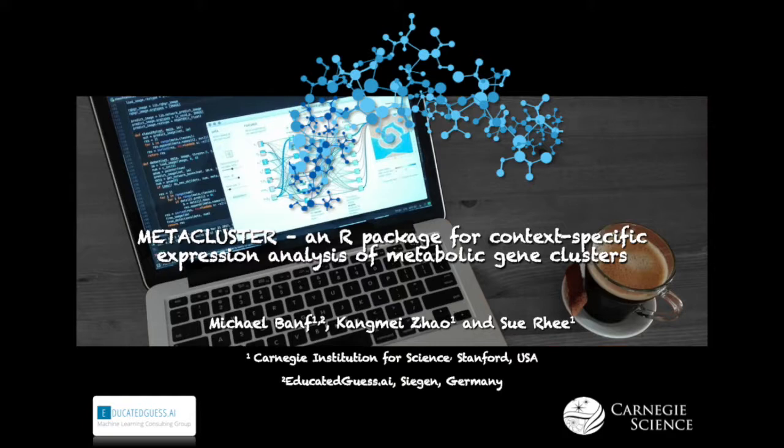So that's it for our little hands-on tutorial on how to use our MetaCluster software.